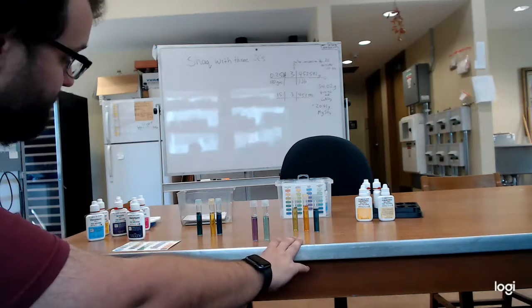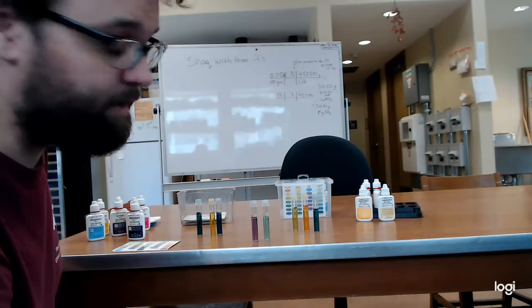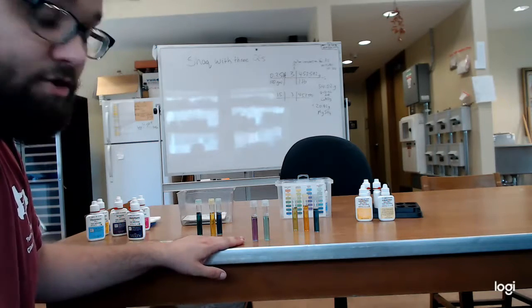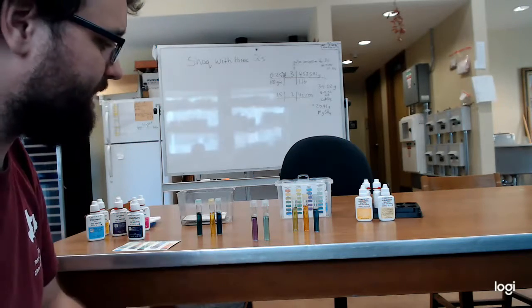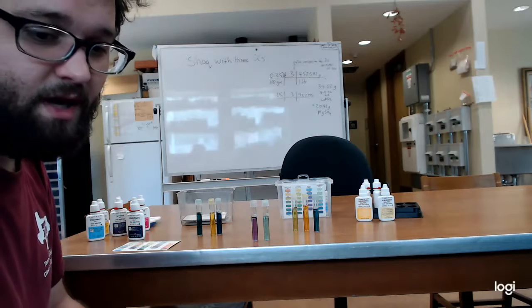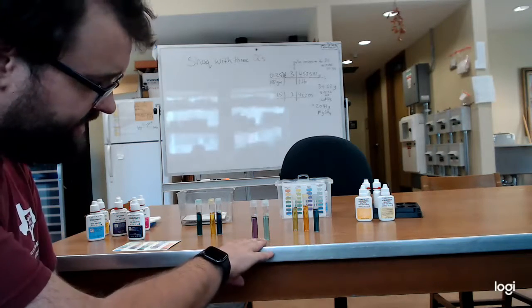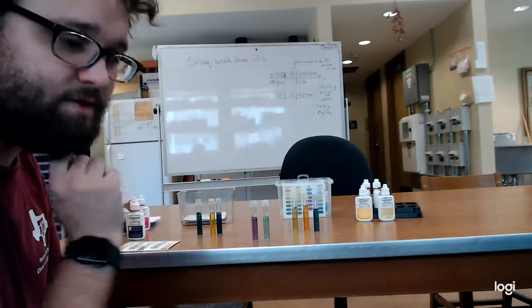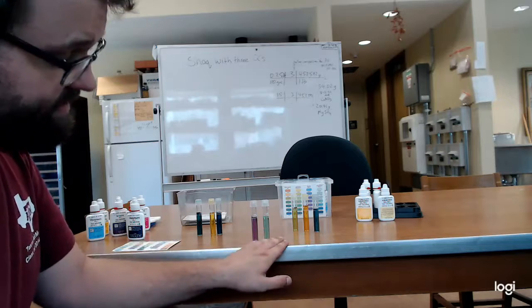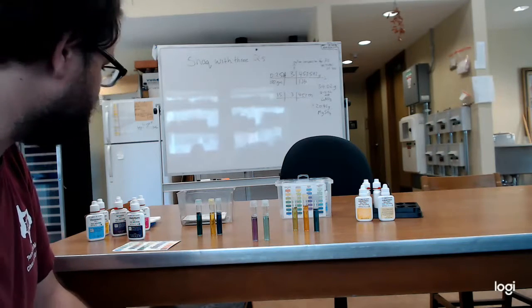So in the compost tea, all of the nitrite has been converted into nitrate because of the nitrifying bacteria in it. In the nutrient solution, it has not been converted. This was holy mackerel, so some of it is nitrite and some of it is ammonia, some of it is nitrate. But as you can see, we have a stop in the process here. Something is not continuing that nitrite into nitrate, whereas it is in the compost tea, it isn't in the nutrient fertilizer.